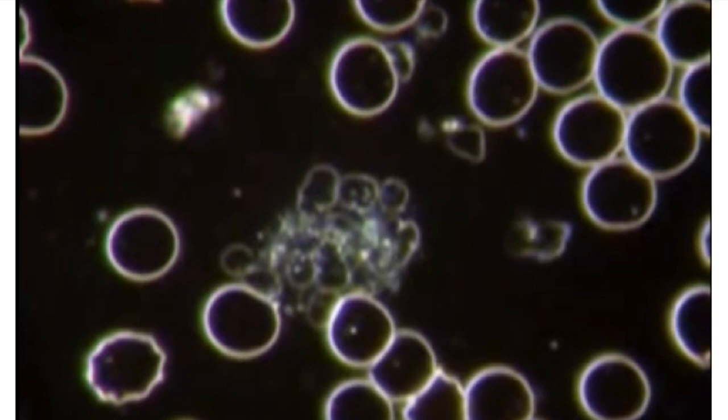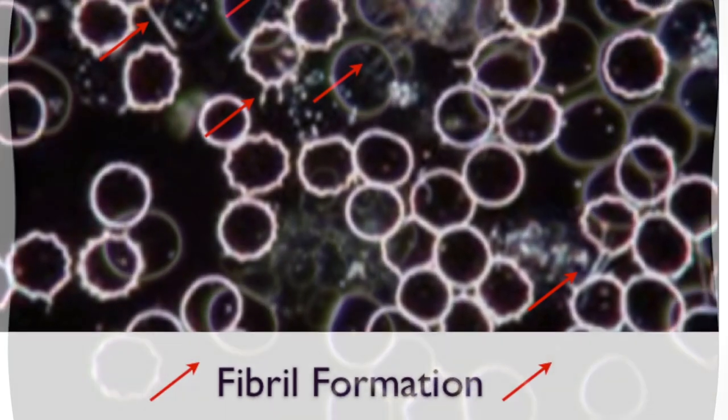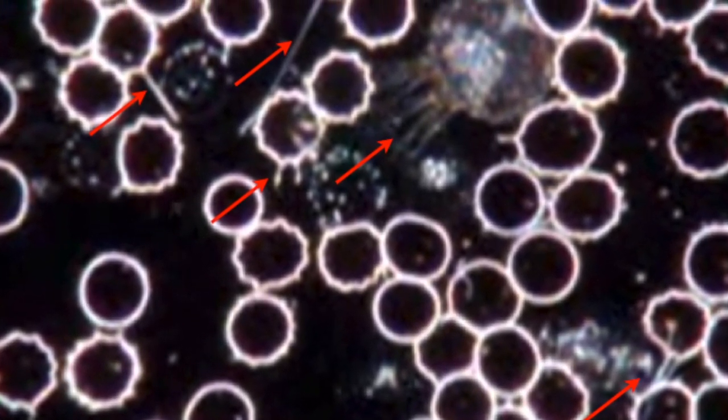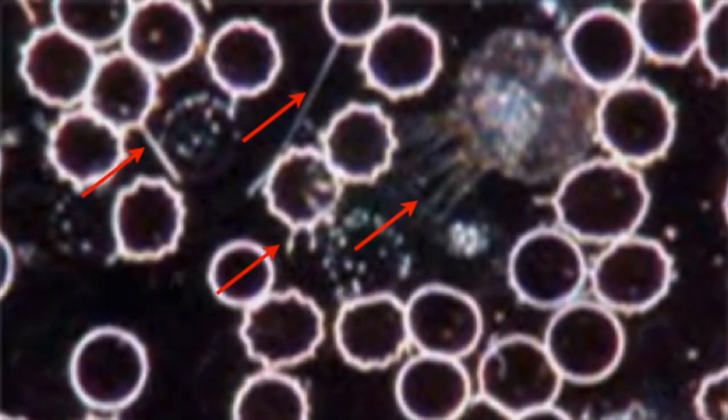An example of this occurred with a patient suffering from liver cancer that was being supported by my office. Their live cell samples started out looking normal, but within seconds deteriorated. The fibril formation looked like cracking glass special effects from a movie, after which the slide was completely muddled.